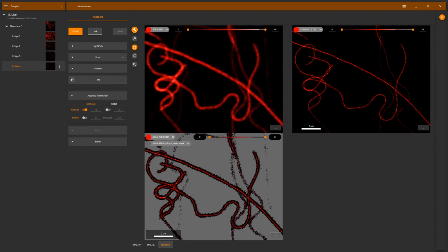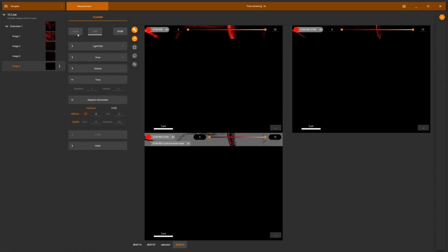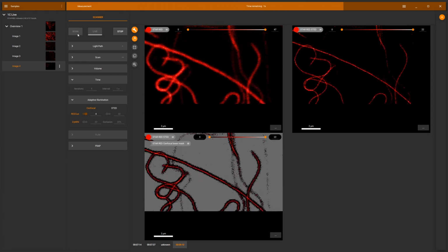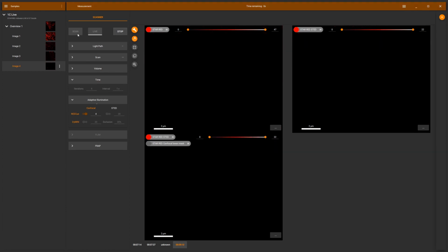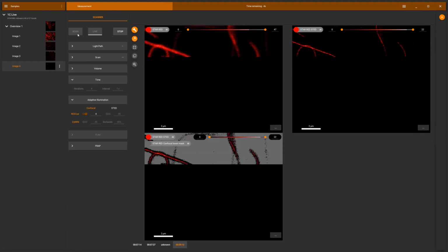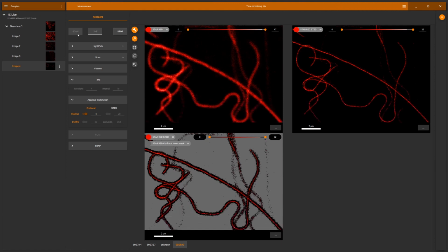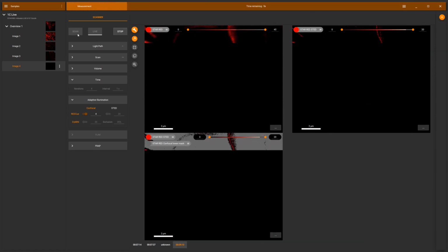We can also do a short time frame here, let's say 4 iterations, but this is of course an excellent tool to do long time live cell imaging. And you can see, even despite optimizing and playing around here, the dyes are still fully functional, bright and stable.